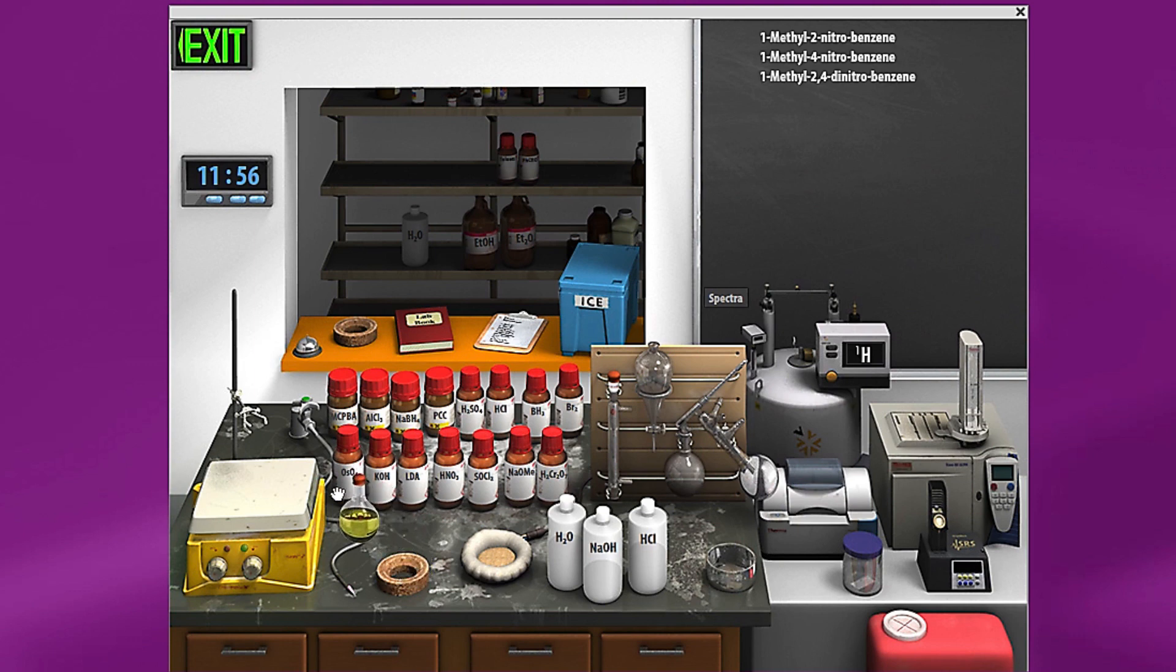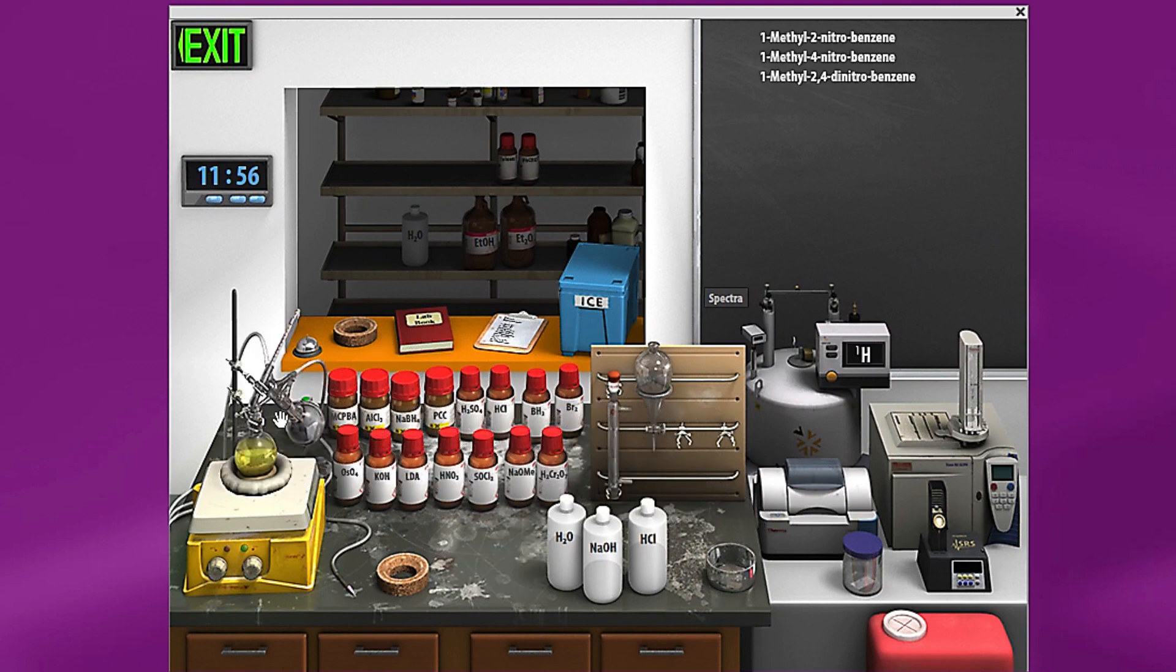Now to do the distillation, you'll drag your organic layer back here onto the stir plate and put it in place. Then you'll come back over here and grab your distillation apparatus, drag it to your flask, and it will go in place. The distillation apparatus has a thermometer here. If you hover your mouse over this thermometer, you'll see a temperature which will change as we begin the distillation.